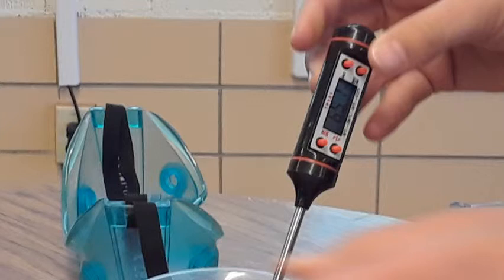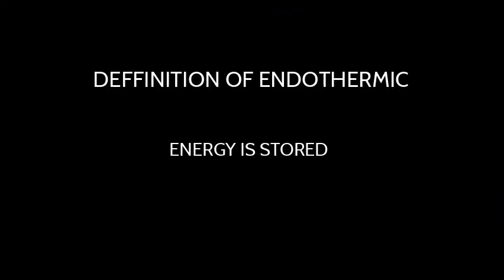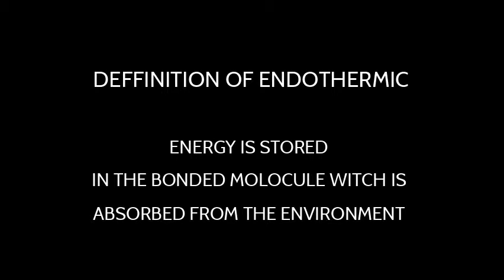So there was a transfer of energy when we added both of the solutions together. The new solution is trying to find equilibrium, so it steals heat from other things, making it feel cold. We also saw that a gas was produced because we saw bubbles. This is an endothermic reaction because energy was absorbed from the environment, making the temperature decrease.